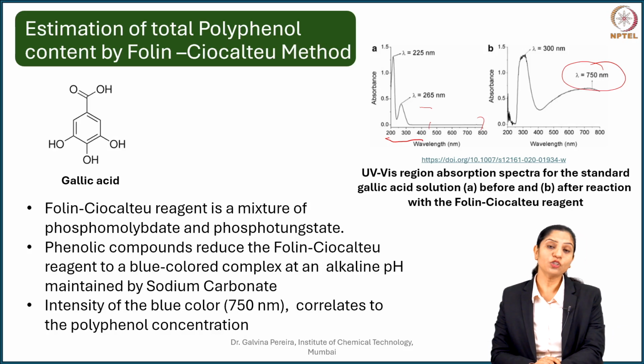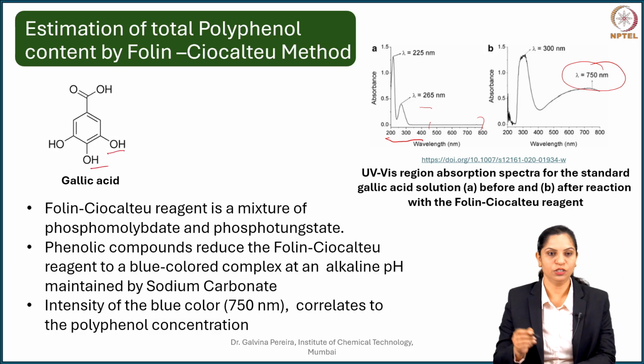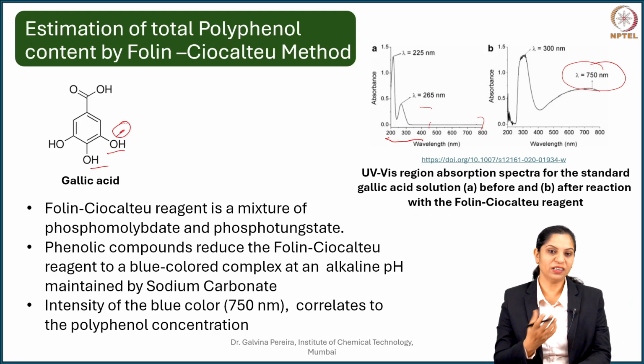Now this complex is preferably formed in alkaline pH. The reason is we want all of these hydroxyls to get ionized, to get O-. Only then it forms a better complex. So it forms a more stable complex.